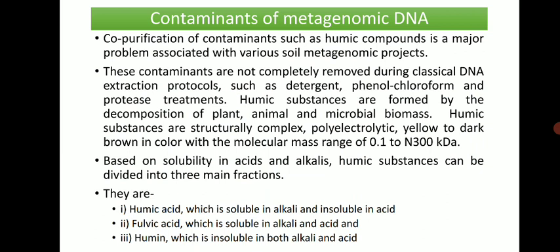Humic acid is a major component of soil, providing nutrients to crops and plants. It plays roles in soil fertility and water-holding capacity, and is a normal soil component. However, from a metagenomic analysis perspective, it is a contaminant. Co-purification of humic acid compounds is a major problem associated with soil metagenomic projects.